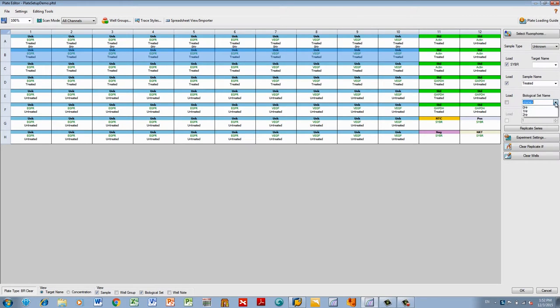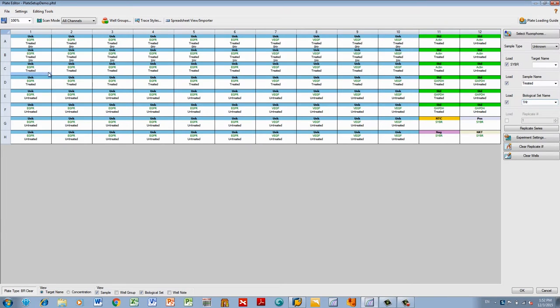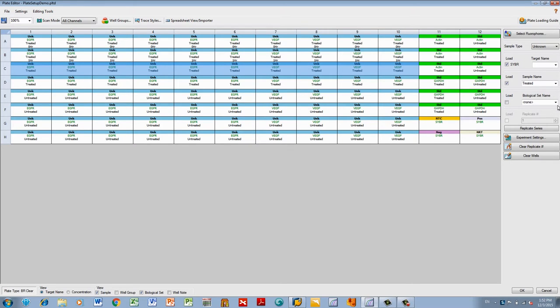Keep in mind that you can assign the same label to multiple sets of wells by holding down the control key while selecting the wells. Repeat this for your other biological sets.